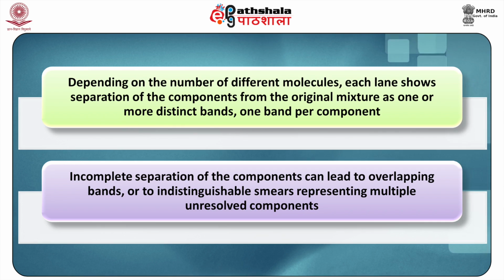Multiple samples loaded on the same gel will resolve into parallel lanes running adjacently. Depending on the number of different molecules, each lane shows separation of the components from the original mixture as one or more distinct bands, that is one band per component. Incomplete separation of the components can lead to overlapping bands or to indistinguishable smears representing multiple unresolved components.